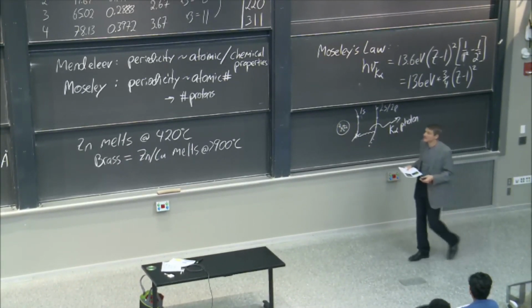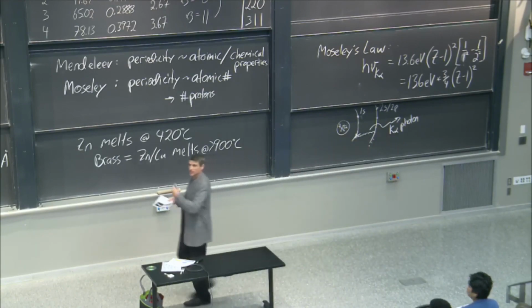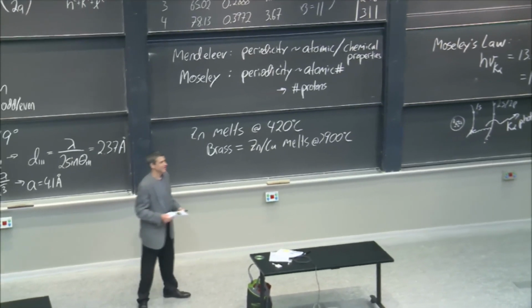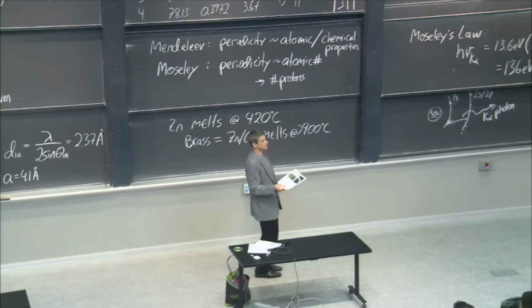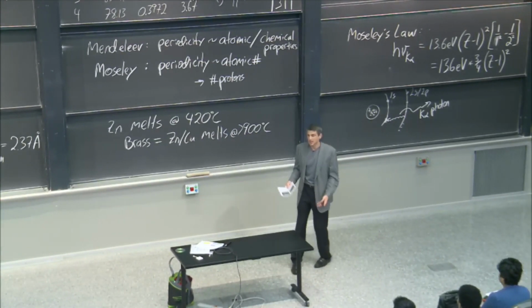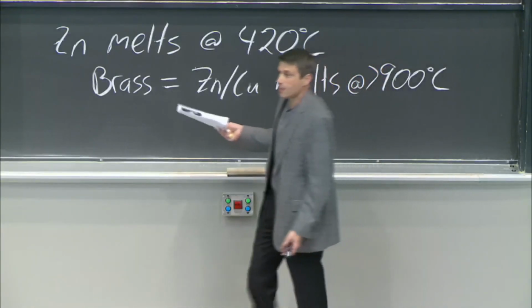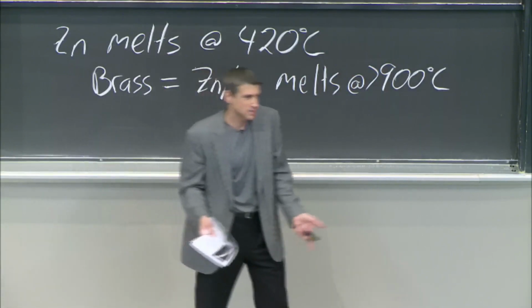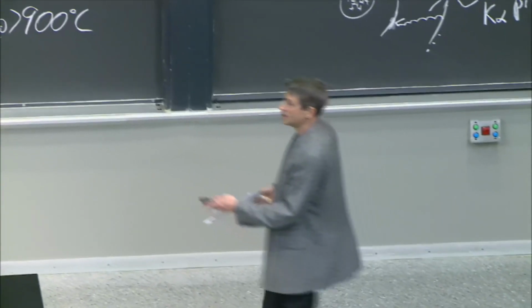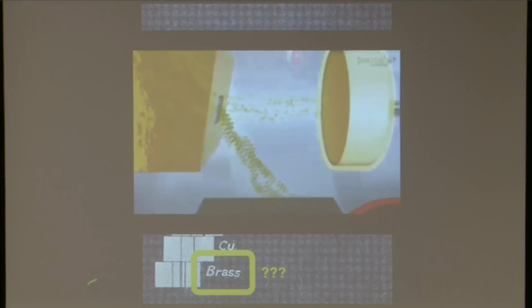And in these experiments, either you cooled it, or you might rotate it quickly, right, so that it gets to cool down. It gets a little break, right? Or you do both. Or you just throw up your hands and you say, you know what, I'm just going to go for an alloy that's got some zinc in it, but won't melt every time. Yeah, that was a good idea. So you put brass in, okay, you're going to get the copper lines, but you'll get the zinc lines. You'll get the zinc lines. Right? Now, that was why he used brass. And that's why you can see you get extra lines in the case of brass.